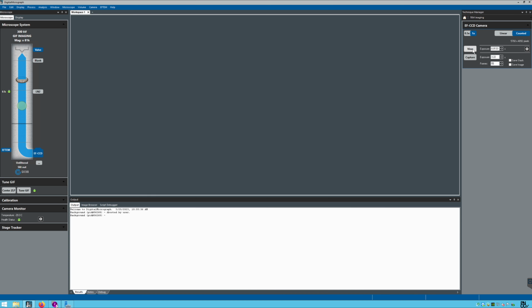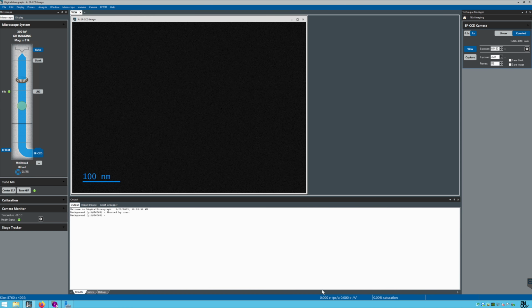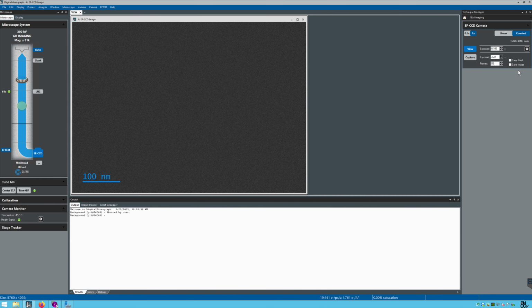So I will first click view, and we can just verify the dose rate. We'll see this in the bottom where my mouse is. Okay, there we go. So adjust the view exposure to 0.1. The dose readout is sensitive to how long those slices are, so I would recommend 0.1 as the minimum when using view. That gives us 19.4, so basically 20.